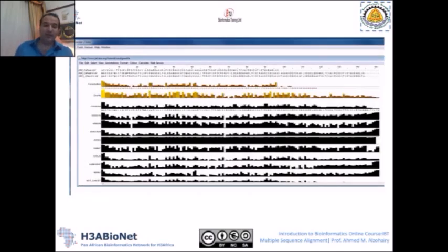And of course, you can show them all, or choose a few of them to show, depending on what you would like to show in your publication, and which part of your sequence you would like to put some concentration on.